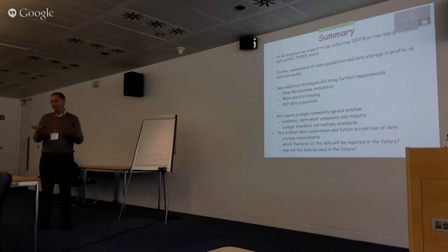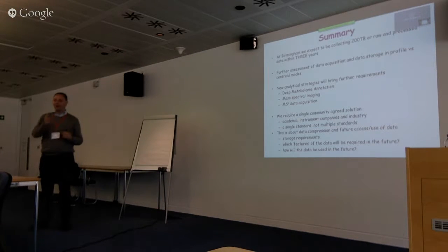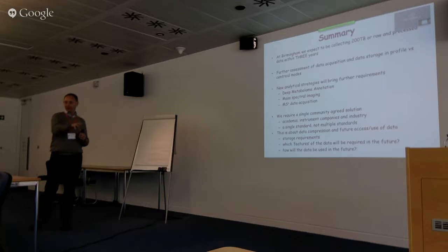They are not so very different, but they are different data sets with more data essentially. So how you apply something to one data set, and one instrument, or one manufactured instrument, isn't necessarily the same as what you would do with a different data set. And that's one to consider as well.